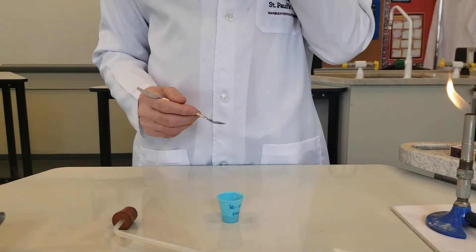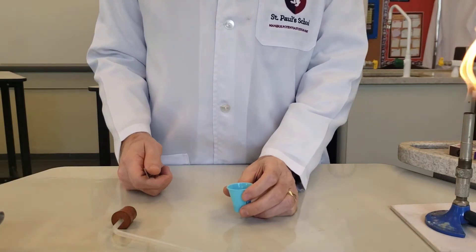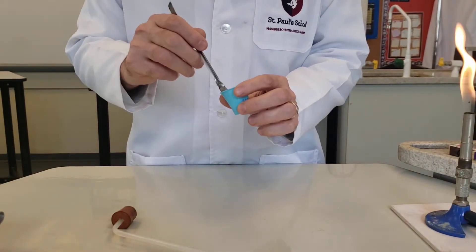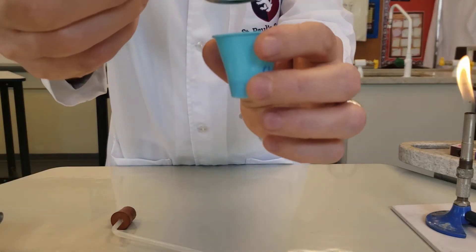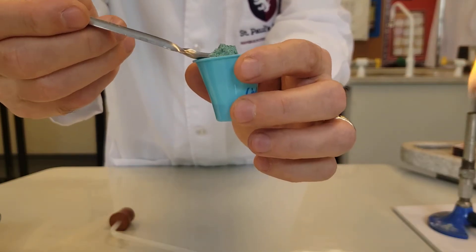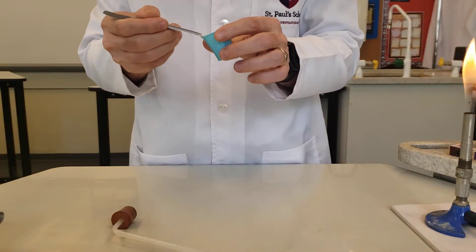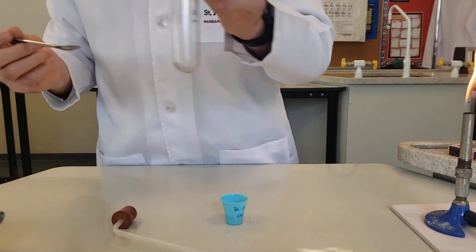Today I'm going to show the thermal decomposition of copper carbonate. Now copper carbonate is a green compound. See there, pale green colour. And what I'm going to do is take a small amount of this copper carbonate in a boiling tube.